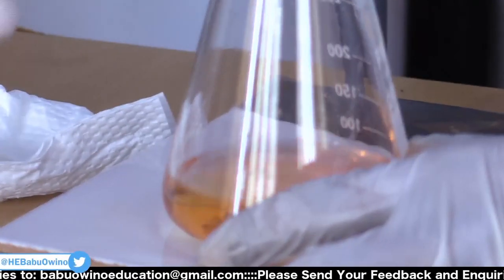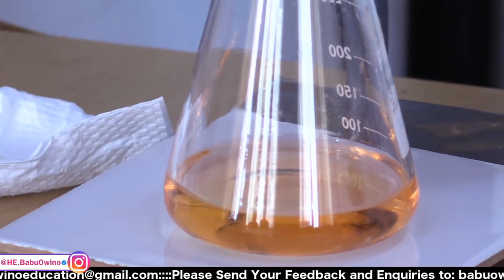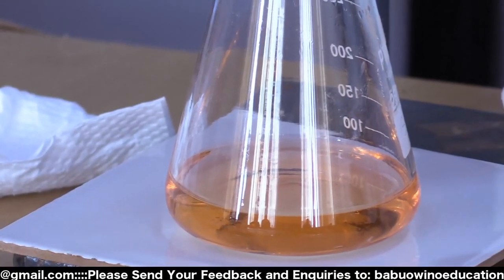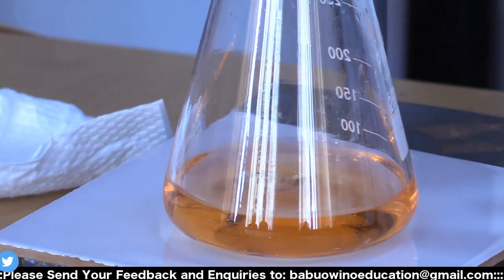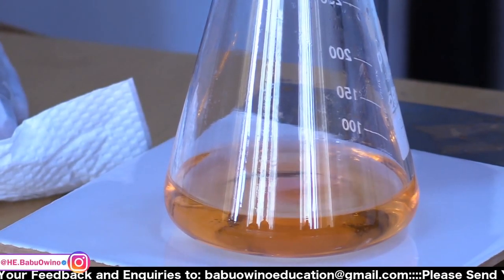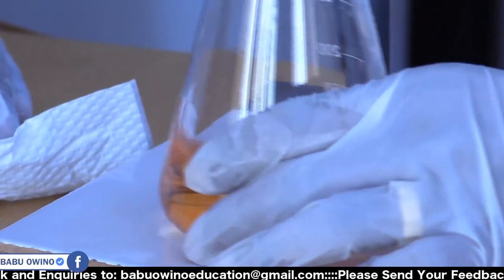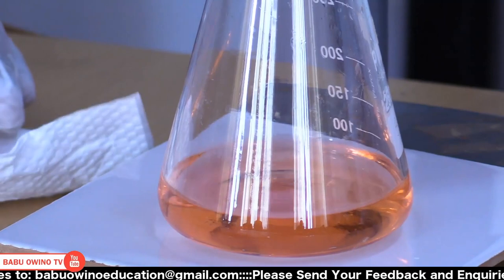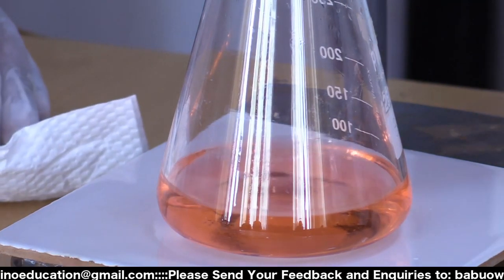So you notice there is a change. That is what we'd be expecting. From there, if you notice that the change is becoming conspicuous, you release the tap to release just droplets, not the liquid as a whole. Keep going until you get the full color. What to expect is pink, as you can see.